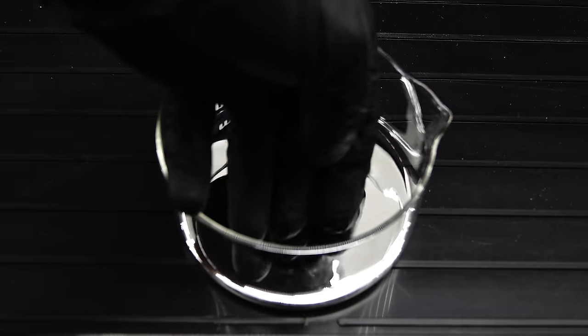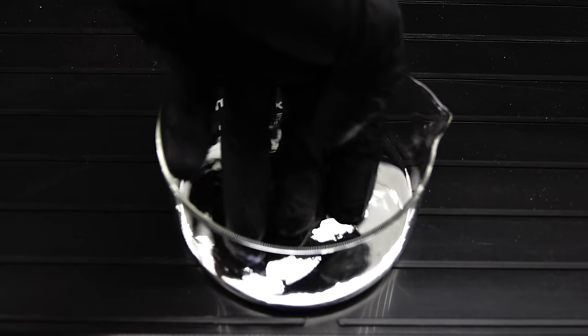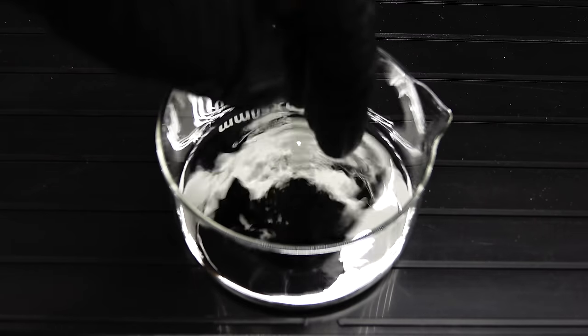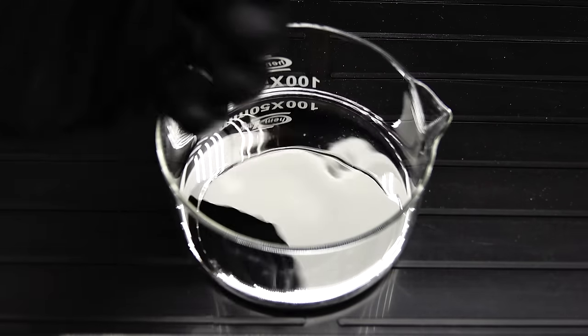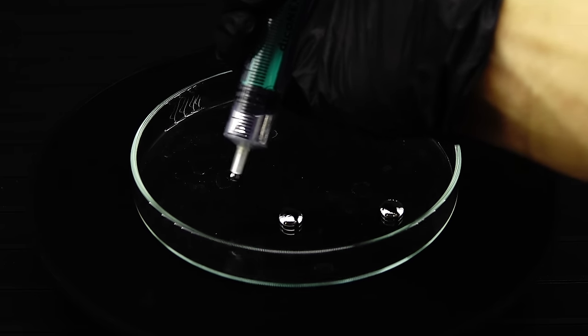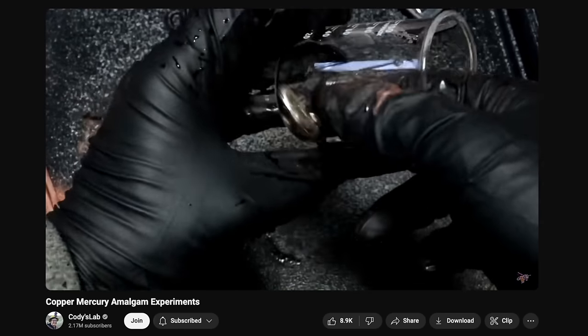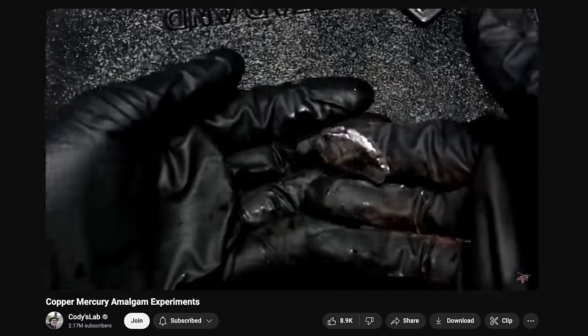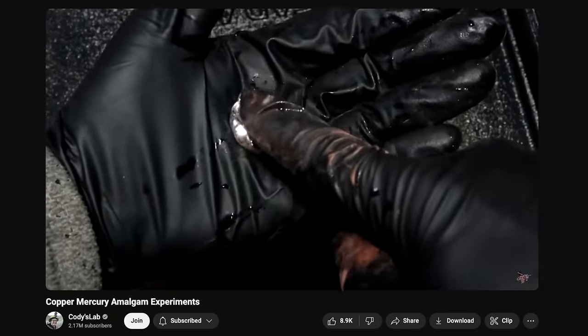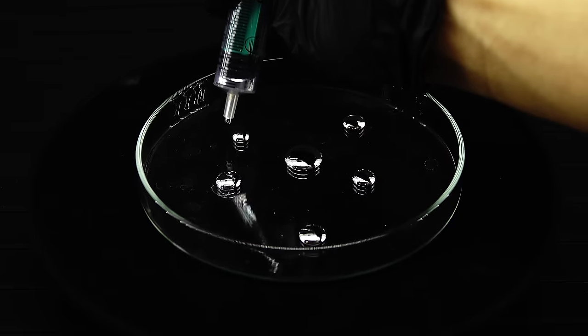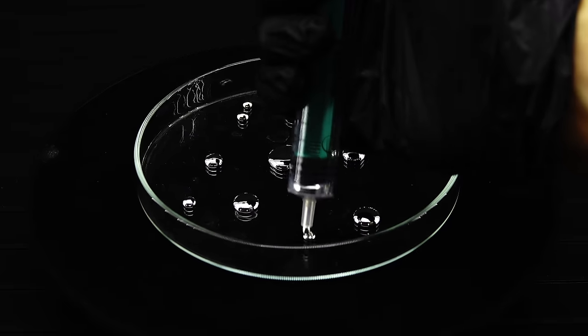Now, I originally wanted to dissolve it and showcase some of mercury's incredible chemistry, but since it's been done before many times on YouTube, I wanted to come up with something fresh. After scouring the internet for like 3 hours, I came across something called mercury copper amalgam, and once I saw it, I knew I just had to make it. This mercury-based substance should behave pretty much like clay, and have many interesting properties, which combined with pretty much no information on it anywhere, made me decide that it's exactly the thing I want to make.